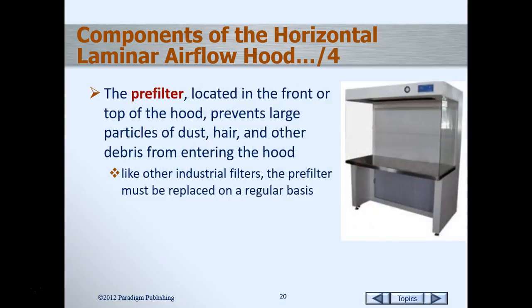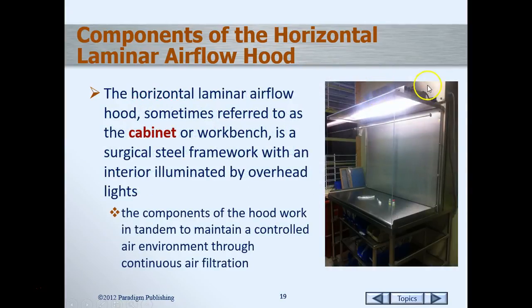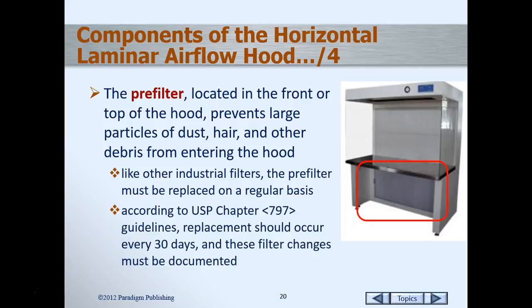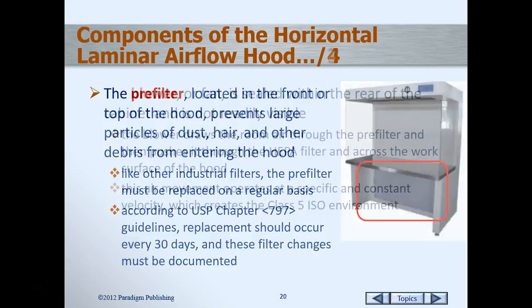The pre-filter is located in the front or on the top of the hood. In the illustration here you see a pre-filter on the front at the bottom, so we have to make sure that we don't place anything in front of that that would obstruct the airflow. In the one we have in lab, the pre-filter is actually up in the top area. The pre-filter filters out the room air and prevents dust, hair, and other particles or debris from entering the hood. It has to be replaced on a regular basis — the guidelines say every 30 days. Remember, it has to be documented, because if it wasn't documented, it didn't happen.